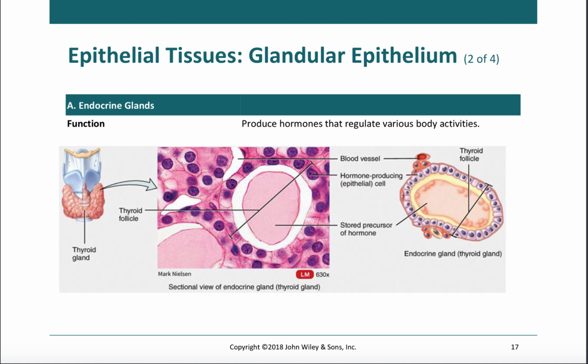Going over glandular tissues, if you look at this glandular tissue, it's pretty obviously simple cuboidal on the edge. The way I know, though, that it's in particular glandular is because oftentimes with the simple cuboidal stuff, you'll see a lake in the center, and that lake in the center is just collecting secretions.